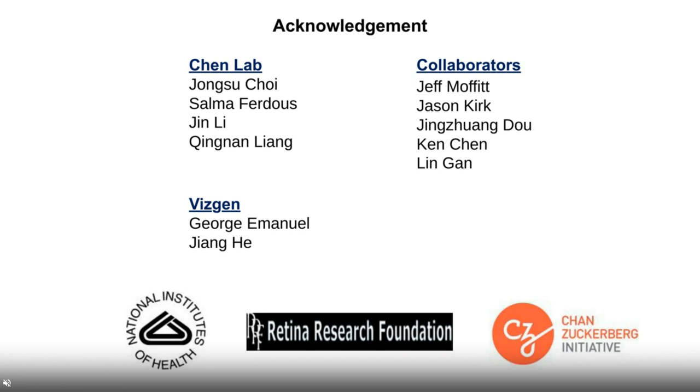Does PFA fixed tissue sample work similarly to fresh frozen sample? And if not, what are the major differences? Yeah, this is probably a good question for John, because he's more experienced in this. Yeah, thanks, Dr. Chen. So yes, the MERFISH protocol works for both fresh frozen and PFA fixed frozen tissue types, and there are I think two key differences.